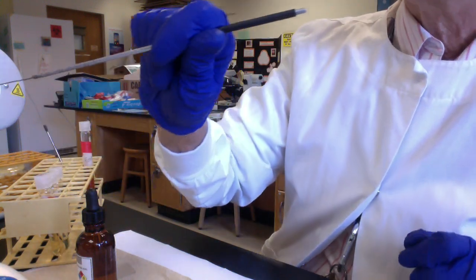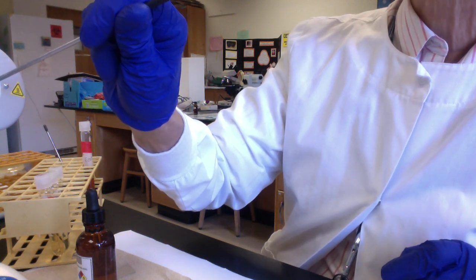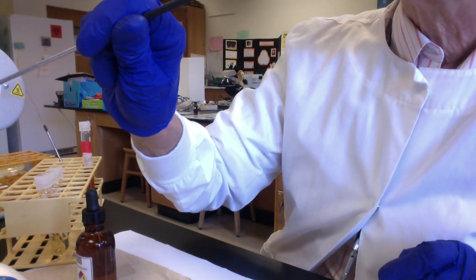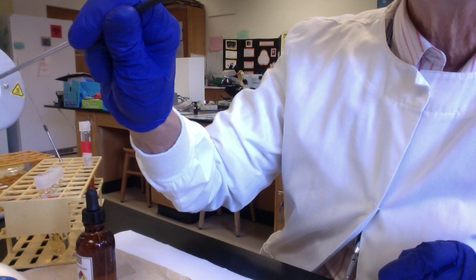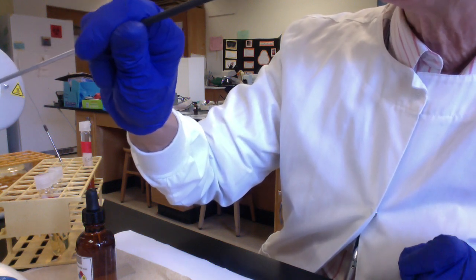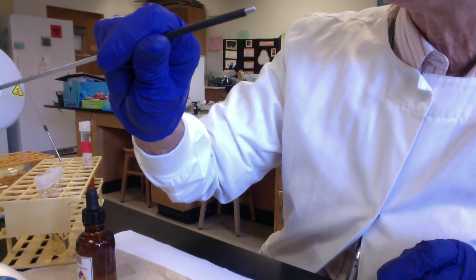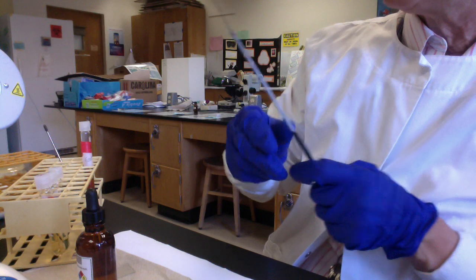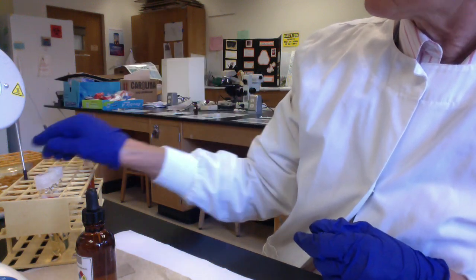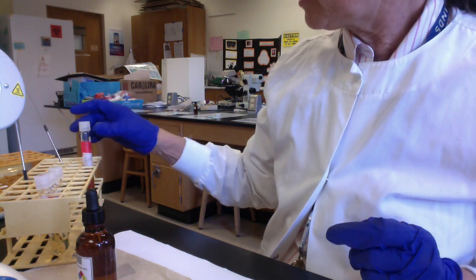Okay, I'm going to sterilize my loop. And folks, looking at the time here, there's one last workshop I need to go to get ready for going online. So I think I'll only have time to inoculate the TSI slant, the triple sugar iron slant. So this weekend when we come back in to look at our results, I'll show you, with the movie showing results, I'll do the catalase test, which is a quick and easy test.